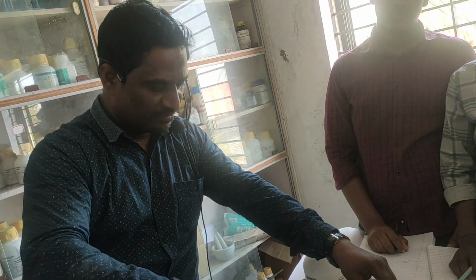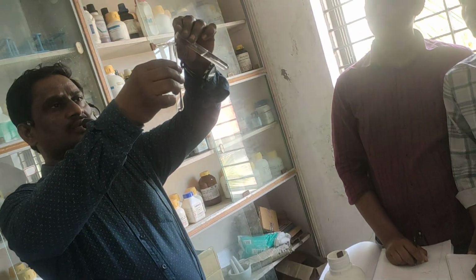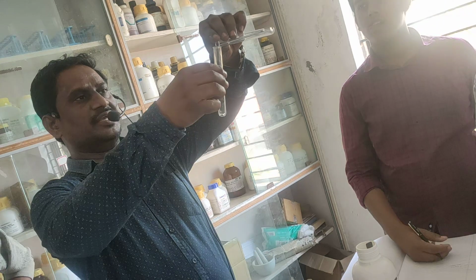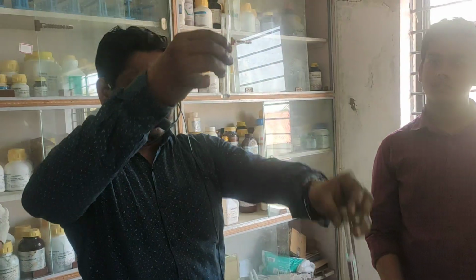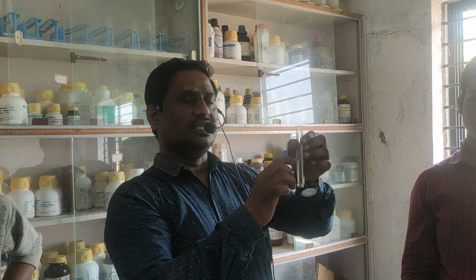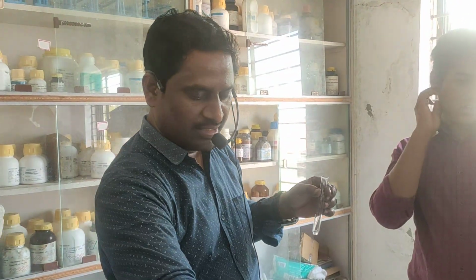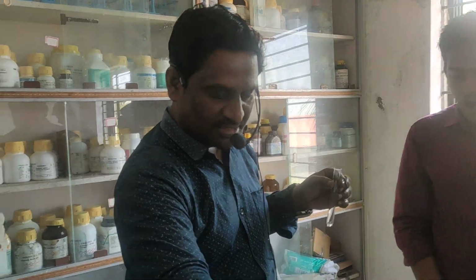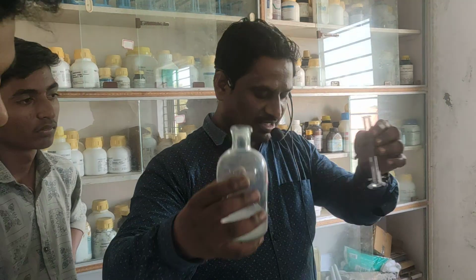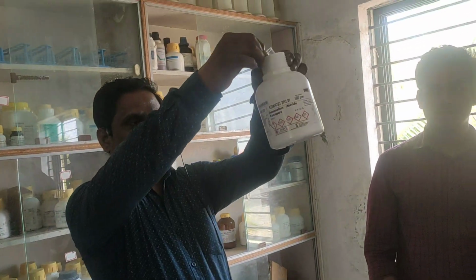Now again for the fourth experiment, where is the original solution? I am taking the original solution. What should I add to this original solution? NH4Cl, NH4OH, and H2S water. So I have to add 3 reagents. First, ammonium chloride is there, which is just like a salt here.